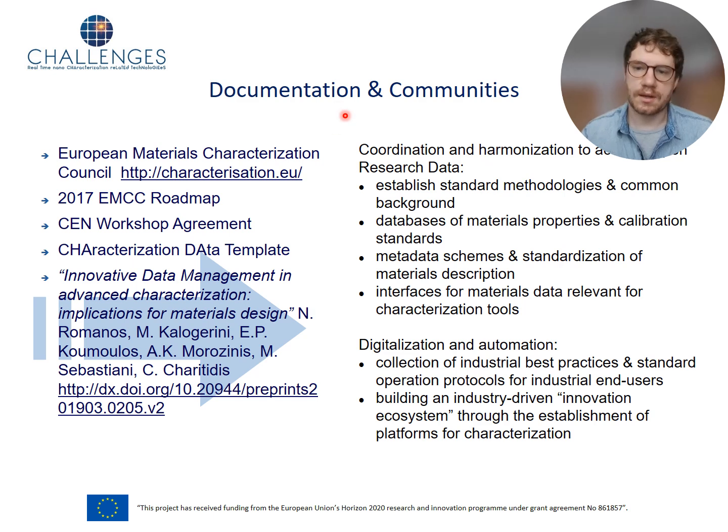Who are the main actors driving these efforts? Well, first of all, there is the European Materials Characterization Council, EMCC, who brought forward a roadmap in 2017. And then there is an agreement of the European Organization for Standardization, CEN, and as a result, there is the characterization data template, CHADA, that I will detail in the following.